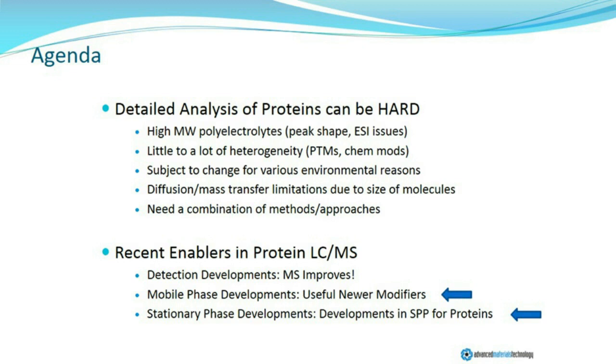They can have great inherent heterogeneity due to post-translational modifications or pre- or post-synthetic chemical modifications, and these chemical alterations can change over time in response to a variety of environmental conditions that the sample can be subjected to.